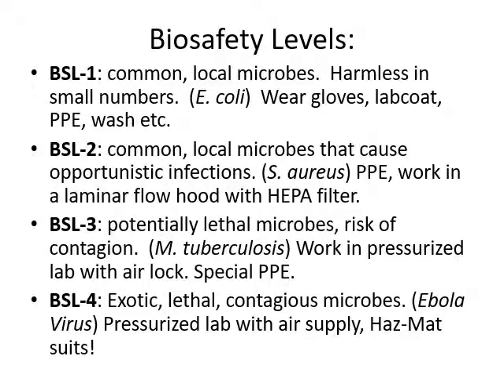Okay, so biological safety level 1, BSL1, is for a laboratory where you're working with common microbes. They're relatively harmless. Basically, all you have to do is wear gloves, a lab coat, and goggles. That's standard PPE, standard personal protective equipment. When you're done for the day, you wash your hands before you leave. You wash your hands before you have lunch. Right? That's a BSL1 lab. Most labs in the world are classified as BSL1.